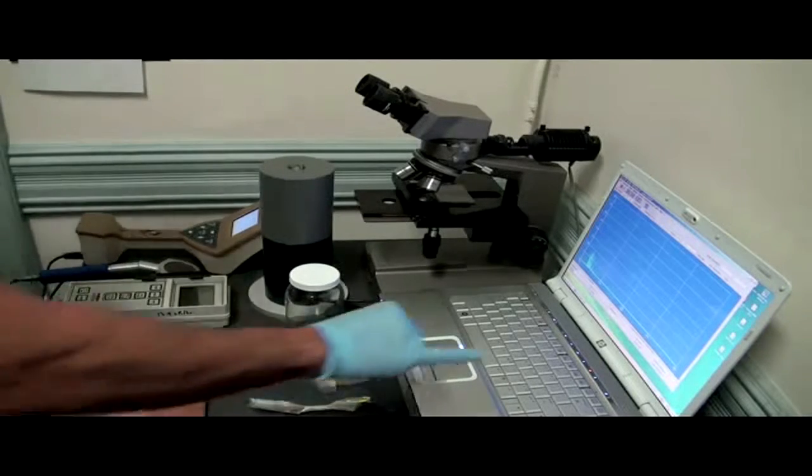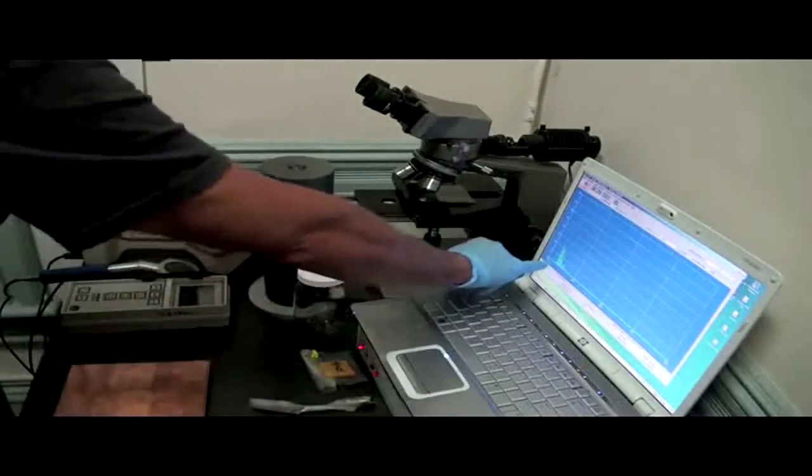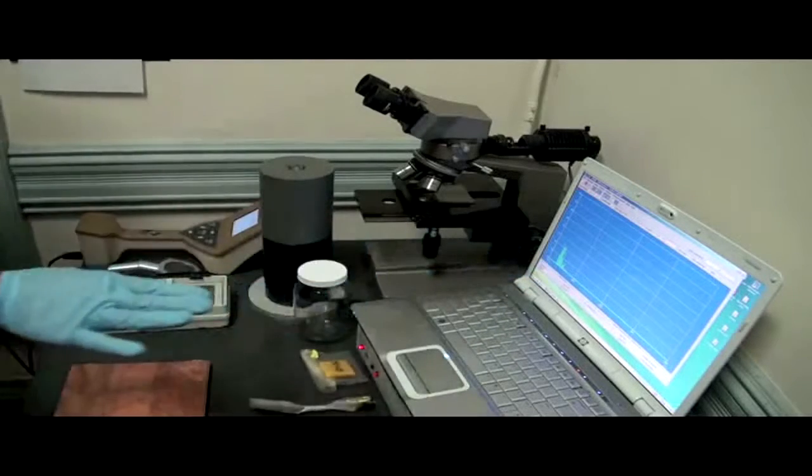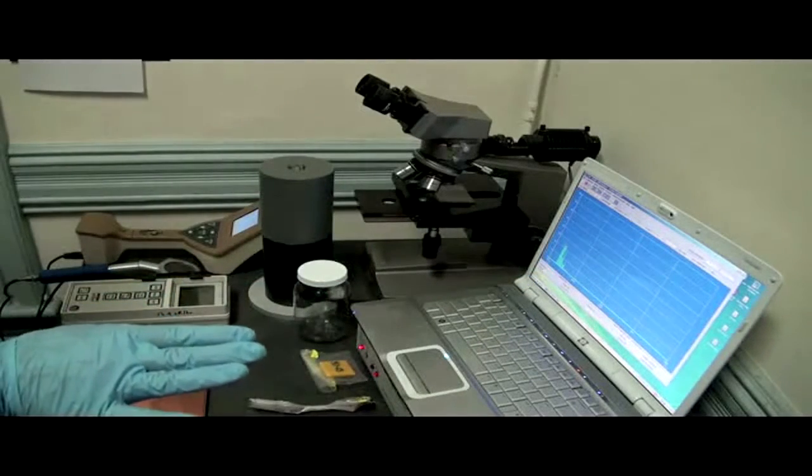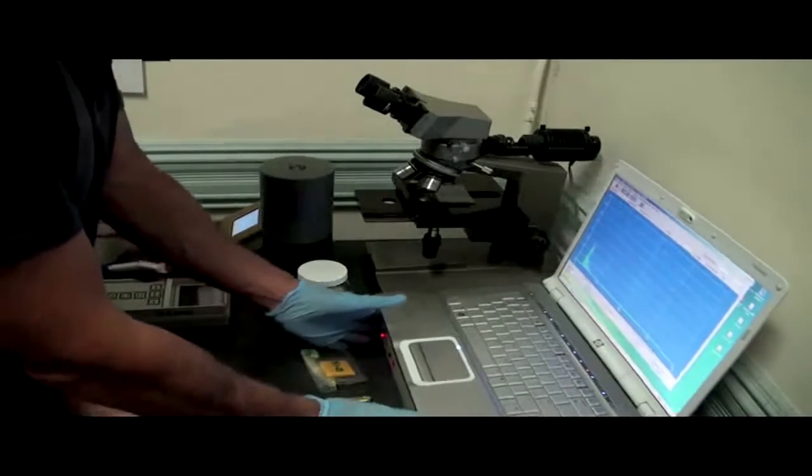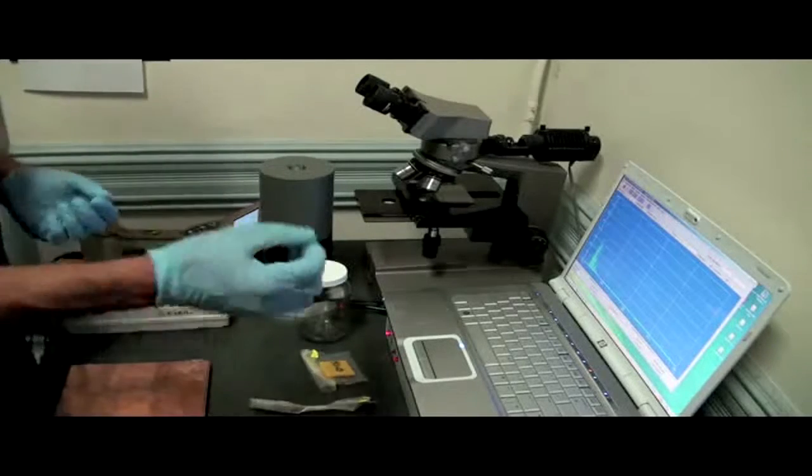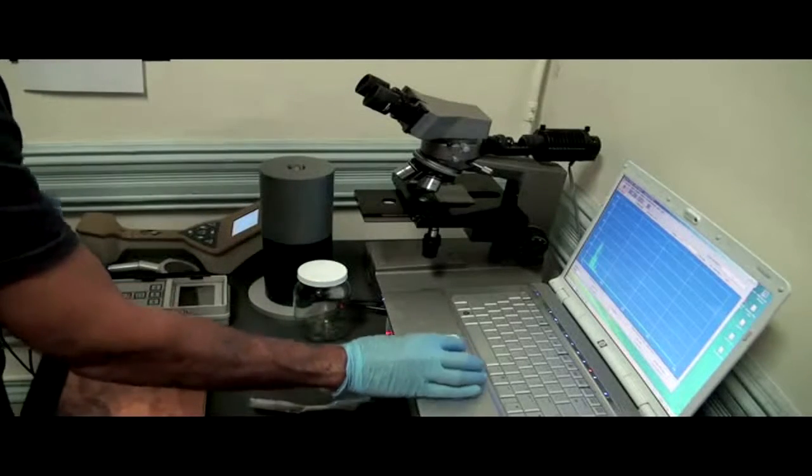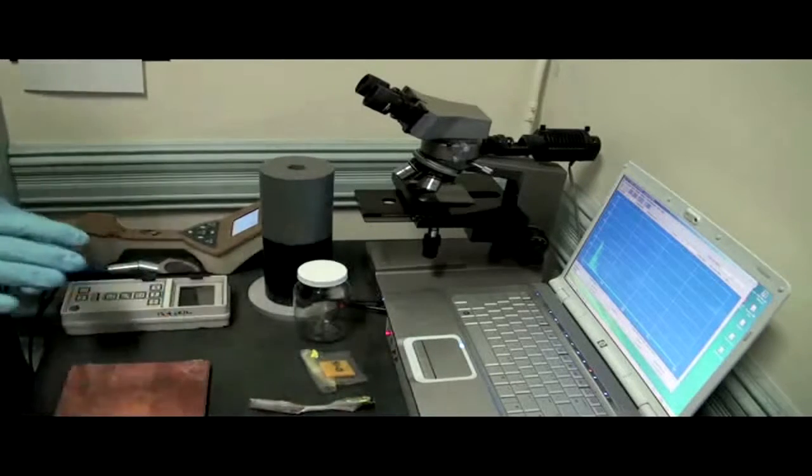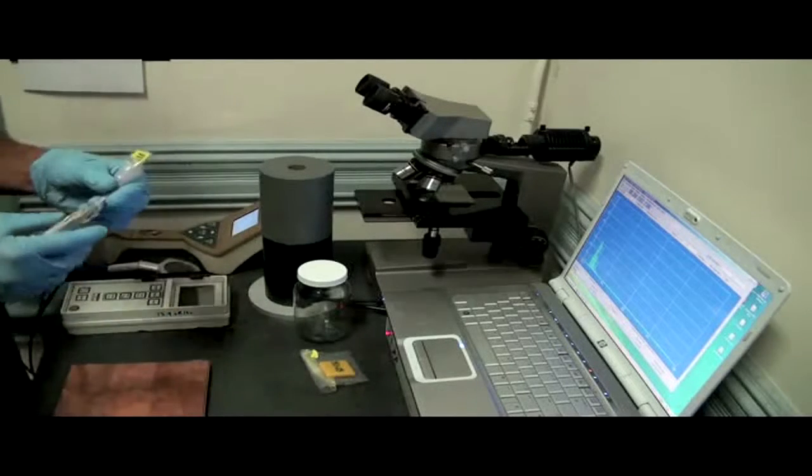And what we get are different parts of our graph. I don't know how easy this is to see. We'll start to see different gamma lines being recorded, and each one is going to be characteristic of the sample that we get. So what we do in the laboratory is we'll actually use a little bit of uranium, and we'll compare and see what gamma lines we get with our instrument. Then we'll take our unknown sample, and we'll actually look at how much of each isotope is present by doing the gamma line search.